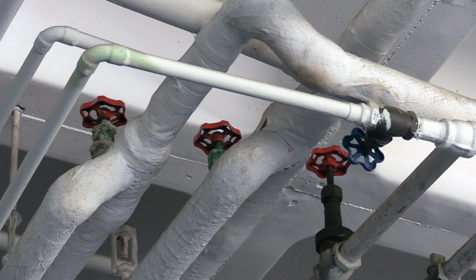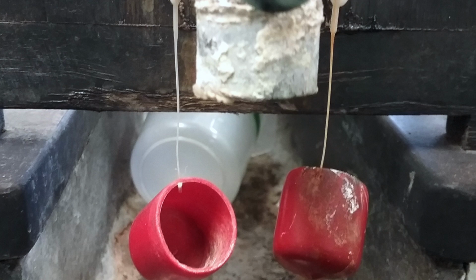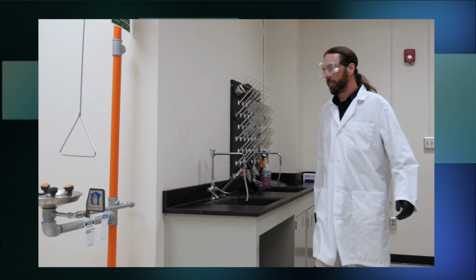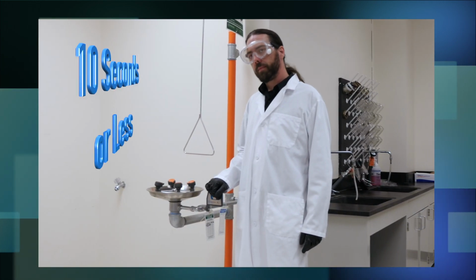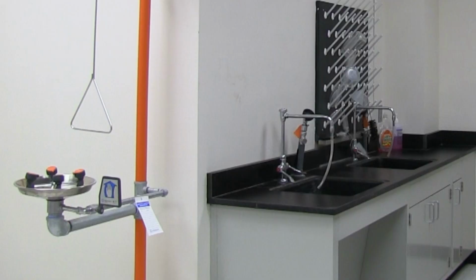Number 1. Pre-planning is important. Know the location of the emergency shutoff valves. Inspect the equipment looking for corrosion, leaks, or damage. Number 2. Check the access route to the eye wash station and emergency shower equipment. Access should be on the same level, immediately available, and have an unobstructed path with a travel distance of 10 seconds or less. If strong acids or bases are used, it should be located next to the workstation.